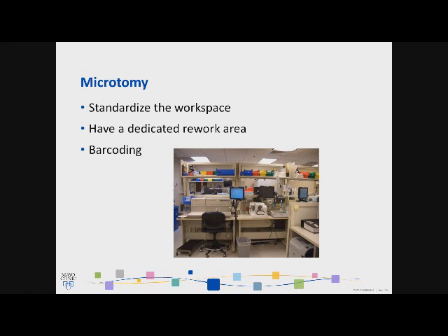This is probably where most histotechnicians spend most of their time. This is actually a picture of our laboratory. You can see that we've tried to lean our lab as much as possible. Like many laboratories, we don't have much space. You'd think that at Mayo we have a little bit more money, but space is a commodity. The only way we probably get to have more space is if we stack our technicians on top of each other. But what we try to do is standardize our workspace.